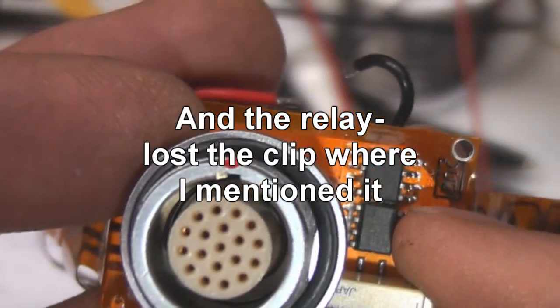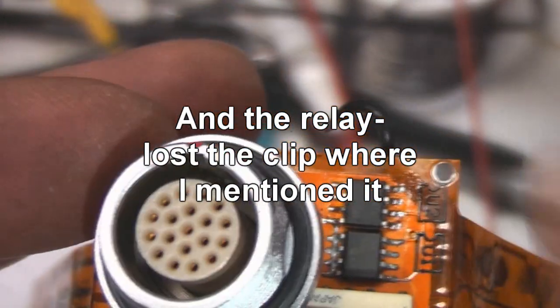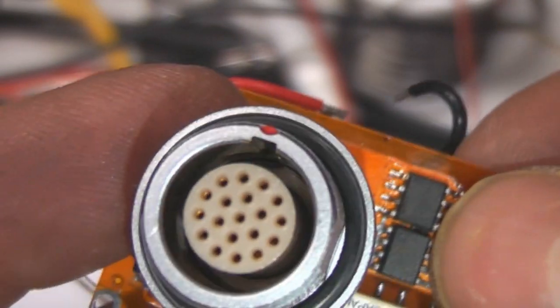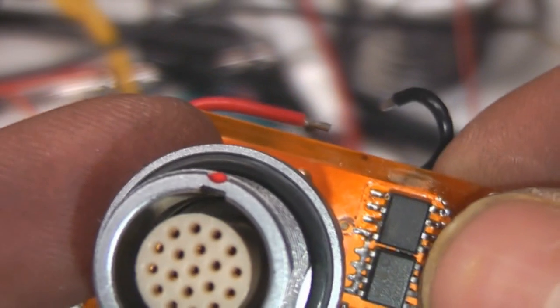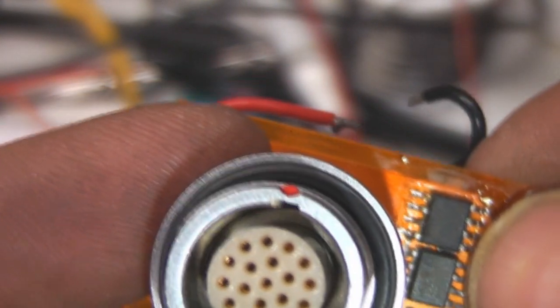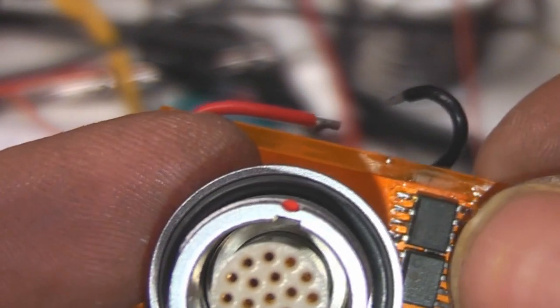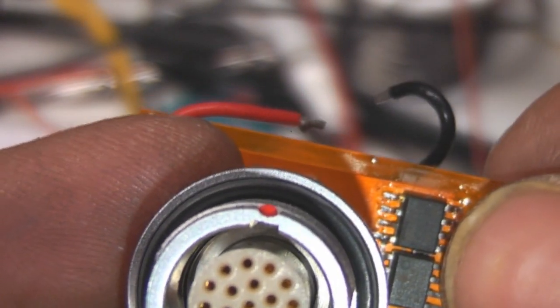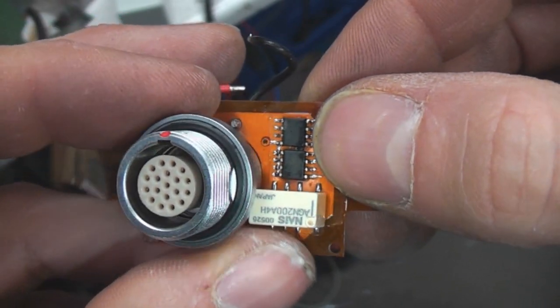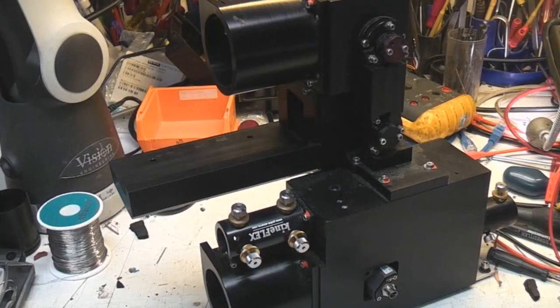Yeah, there's these two chips. There's a 24LC02 E squared PROM, and there's another chip here which I can't identify, but it's only connected to I squared C and power and nothing else. So it's either another memory or it's a temperature sensor. Although I'm not quite sure why you'd need a temperature sensor with all the thermistors in there, unless it's to maybe get some sort of absolute reference to calibrate against. I had a brief look at other temperature sensors with that pin out, but I can't immediately find anything that matches it. I've just read that 24LC02, and there's nothing in it, so they haven't even bothered using it.